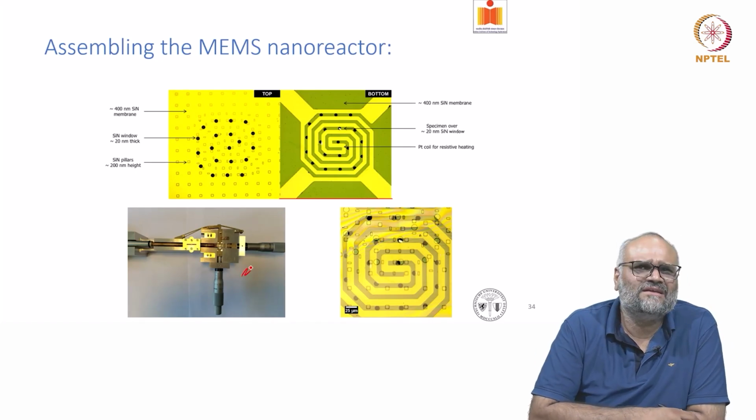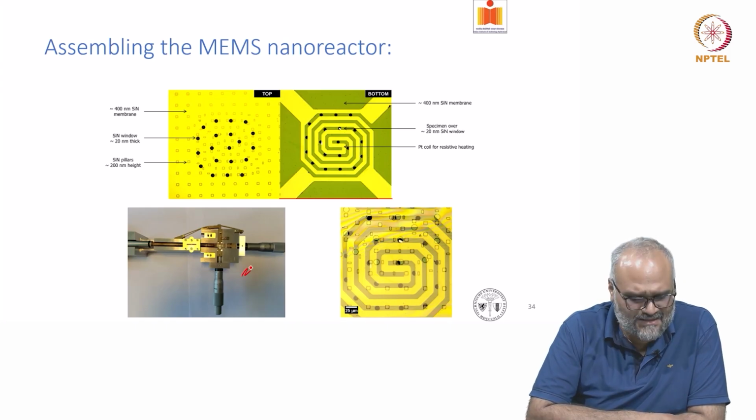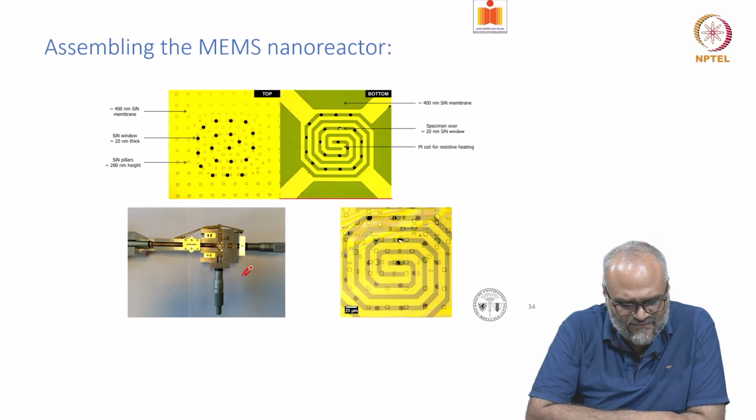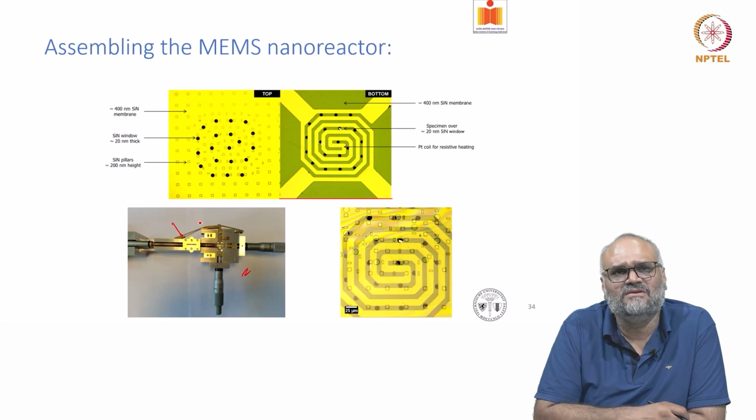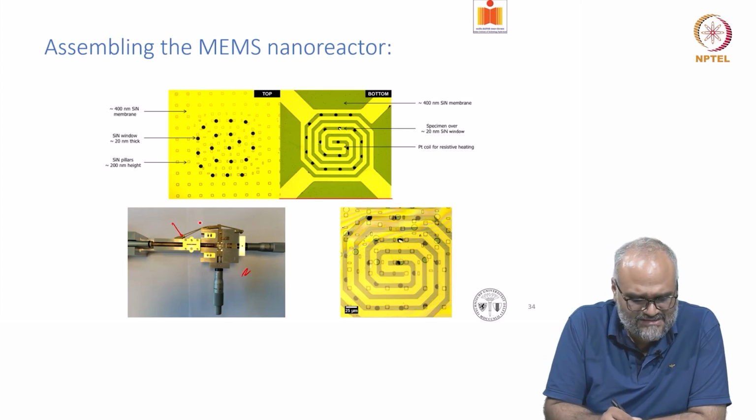This was one of the first prototypes that we made. In fact, the very first version of the holder that we developed actually did not have the option to put an alignment holder into the alignment tool, and it was separated.